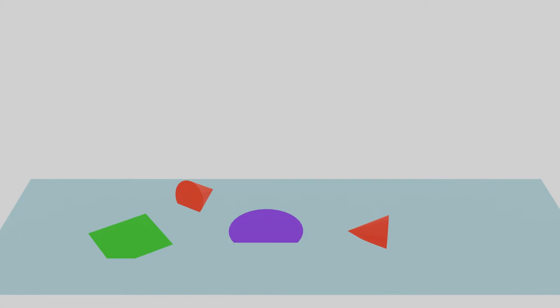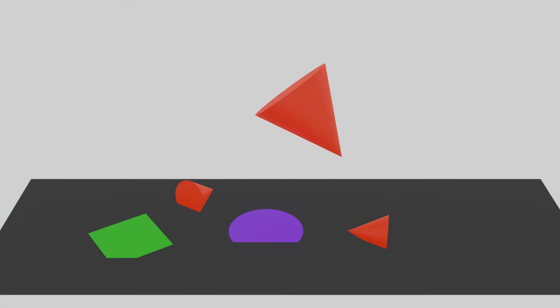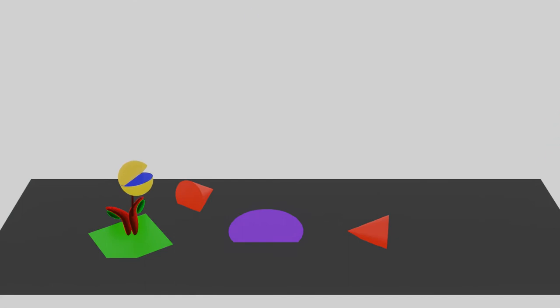Simple. Block the remaining sticky surface first, so that nothing else can stick to it. Only then add the antibody. The enzyme portion can be changed to any detection method you want.